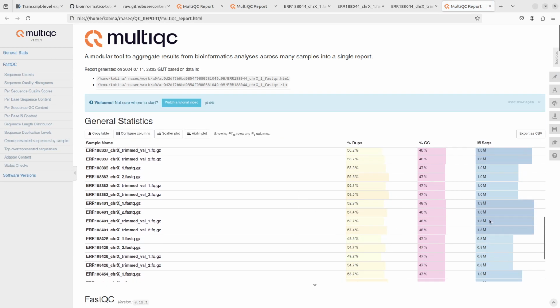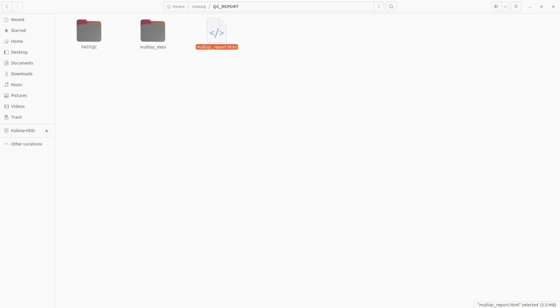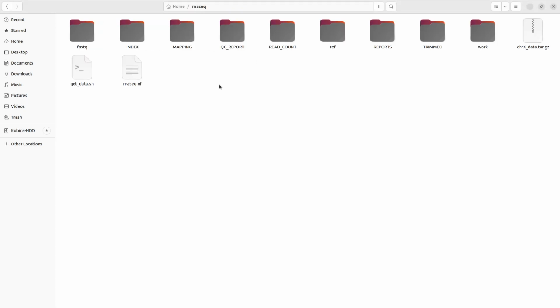I've also isolated just this one for you in case you want those reports. There are lots of things you can do. You can customize the scripts to do many things, by the way. If you have any questions about the script usage, you can just let me know. So that is what you have.